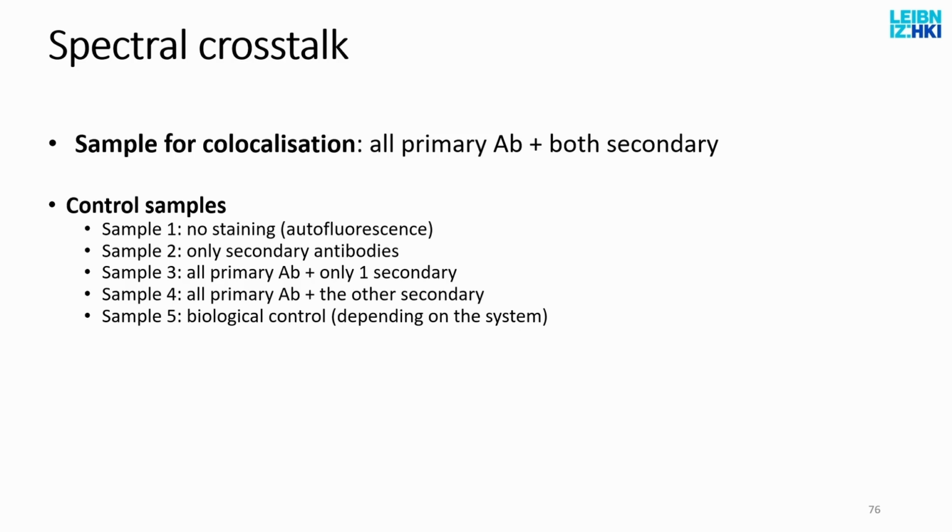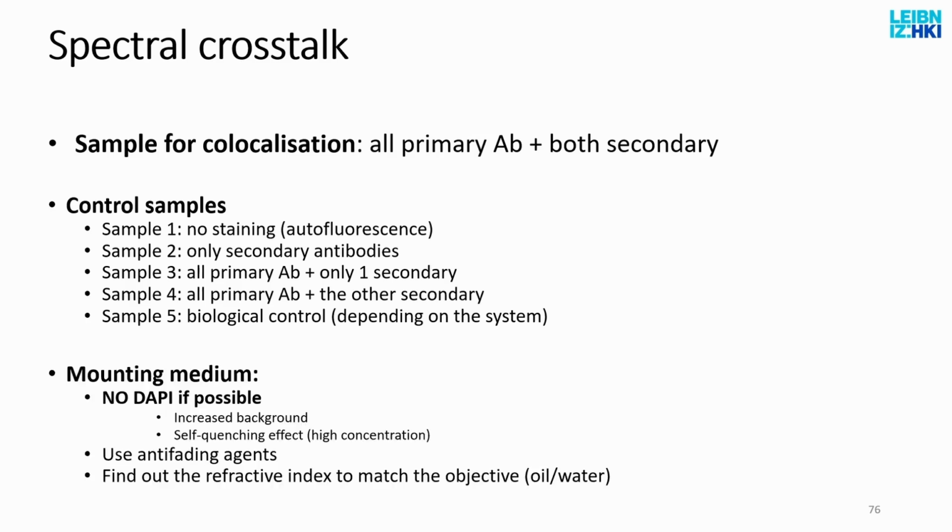If you don't do this, and then you acquire a whole bunch of images, you are locked down because you cannot analyze the images, because you don't know how much crosstalk you have. In terms of mounting medium, anti-fading agents to protect the label, we will talk about in a minute.